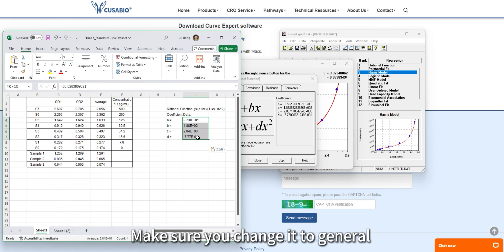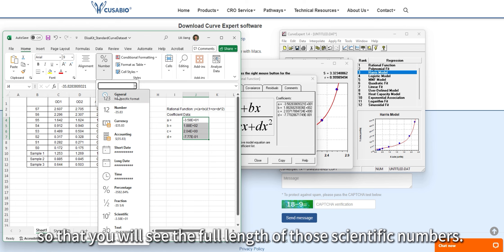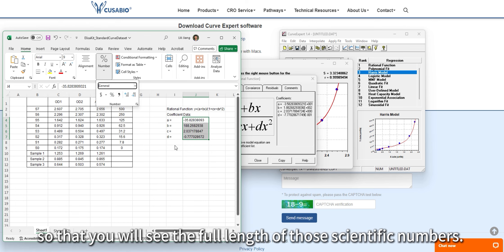Make sure you change the format to general so that you will see the full length of those coefficient numbers.